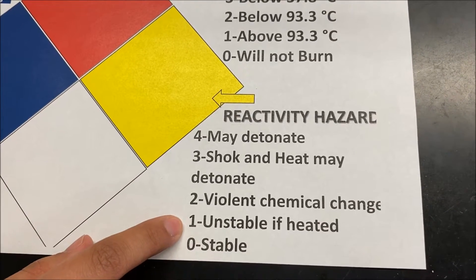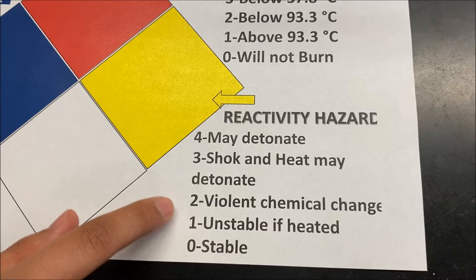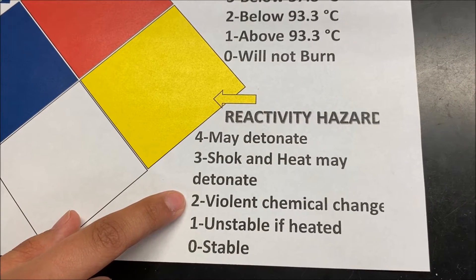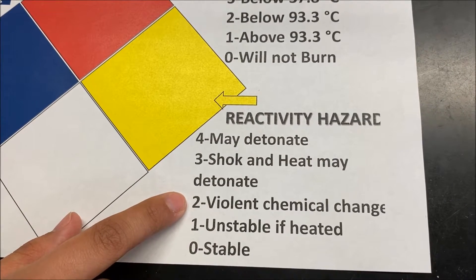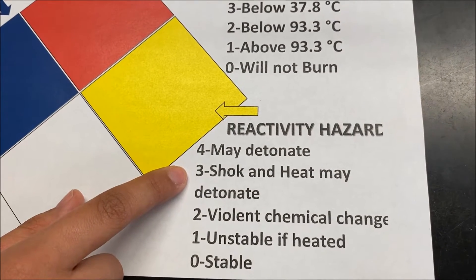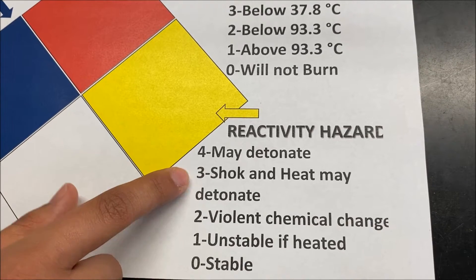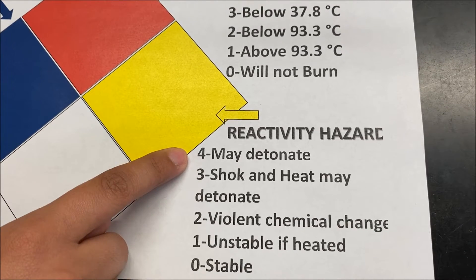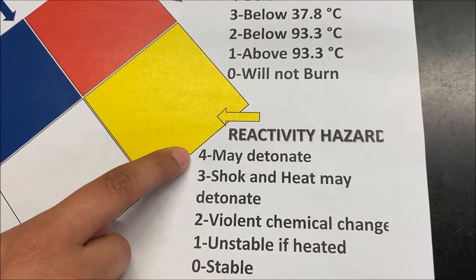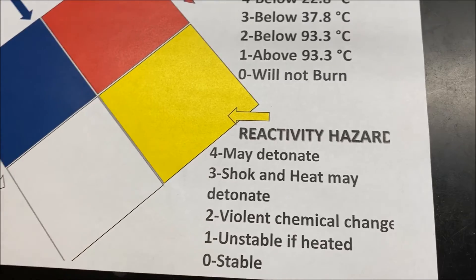For reactivity: 0 means the chemical is stable. 1 means it is unstable if heated. 2 means it undergoes a violent chemical change. 3 means shocks and heat may detonate the chemical. And 4 means it may detonate on its own.